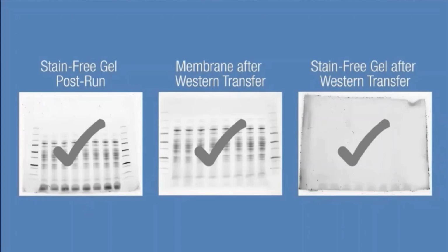So it's highly important to validate your full workflow, but also it's highly important if you want to, let's say, optimize the first stages of transfer. It will guide you whether you have a good transfer and can go with the same method, or whether you need to optimize your blotting voltage or ampere or time.